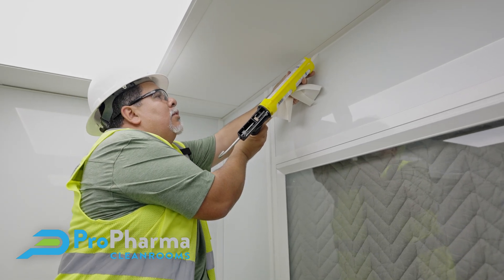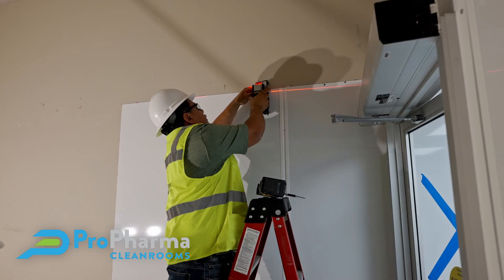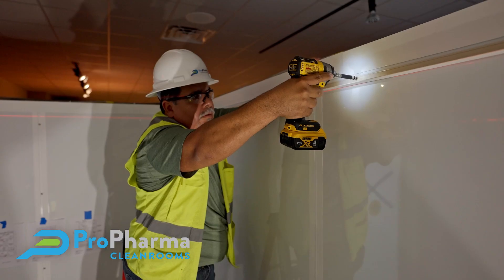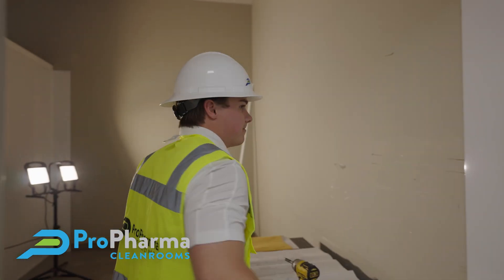Almost every time we go into an existing facility to build a clean room, we face challenges and limitations. I'm going to show you some of those limitations today and how we work through those to make sure we have a facility for our client that works for them. My name is Colin Kemp, ProPharma Cleanrooms Project Manager. Let's take a walk and let me show you how we're going to do this.